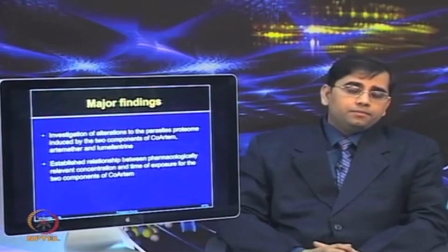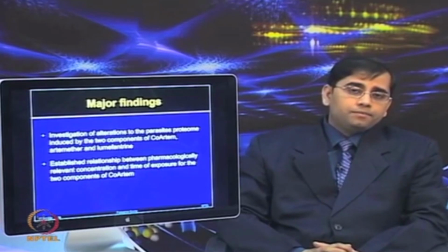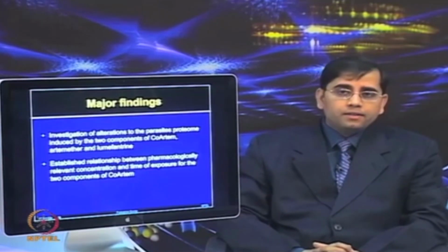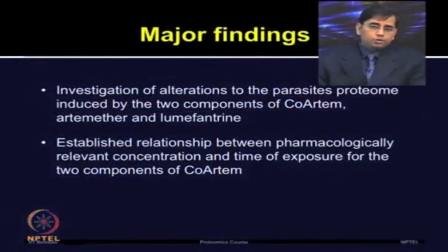So, from this study, the major findings were that authors successfully investigated alterations of parasite proteome induced by two components of Coartem, artemether and lumefantrine. By using proteomic approach, they investigated specific and non-specific effects of two anti-malarial drugs in pharmacologically relevant conditions.